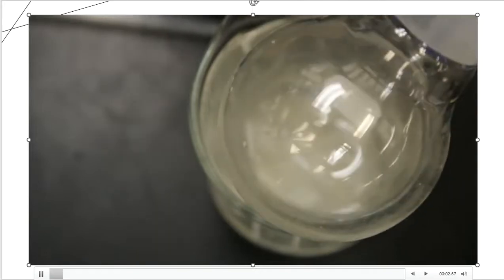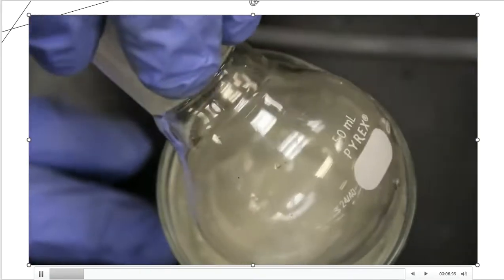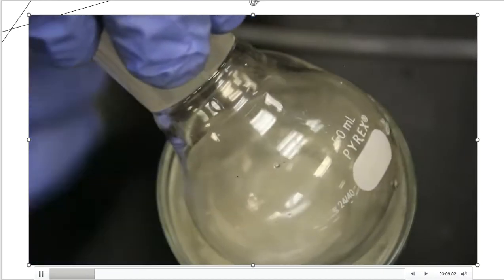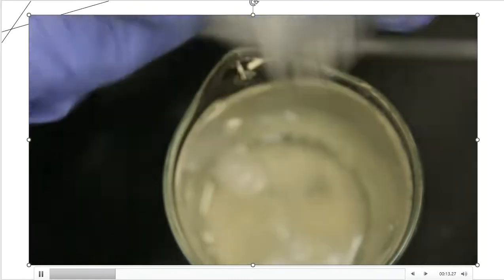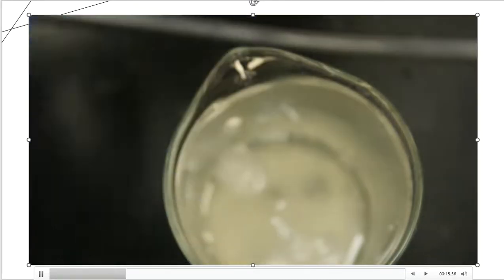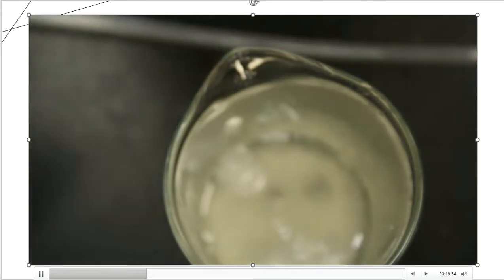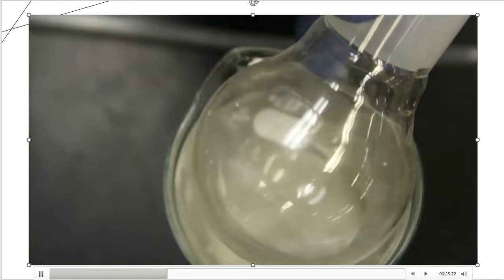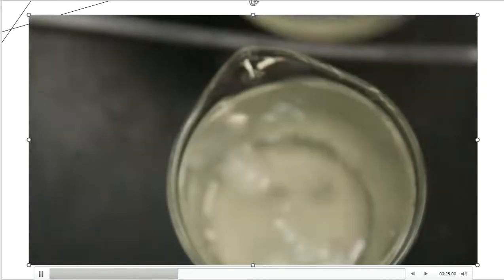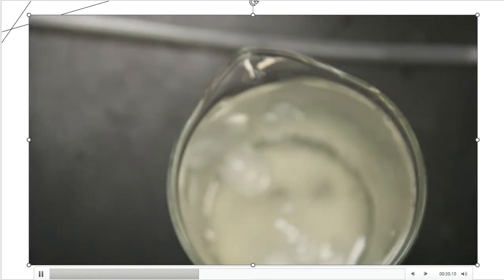Okay, so there's the boiling flask that we had, and I used about two mL portions of methylene chloride. I squirted methylene chloride in here, gave it a swirl, and dumped it out really quickly into the ice bath down below. So I did that three times, total of 6 to 7 milliliters, give or take. Again, it's just estimation, just to help in the transfer to make sure I don't lose any product throughout this next step of the process.